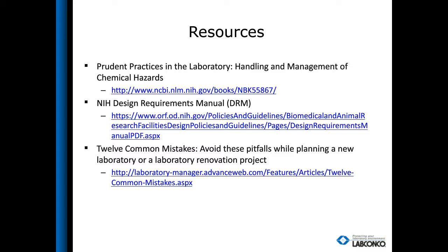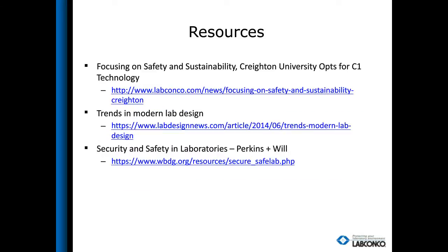Can you talk a little bit more about the hazards to biosafety cabinets that are plumbed together? Depending on the type of cabinet that you have ducted together, in the examples I used, we were looking at type B2 biosafety cabinets. Those cabinets require an exhaust system to pull through a HEPA filter at a very high volume and high pressure. To keep the physics short, there's no way to easily maintain balance between those, because you're not going to work in them the same amount of time or with the same hazards. One will load faster than the other, which throws the other one out of balance, losing your product or personnel protection and thereby risking either the process or the biosafety cabinet operator.